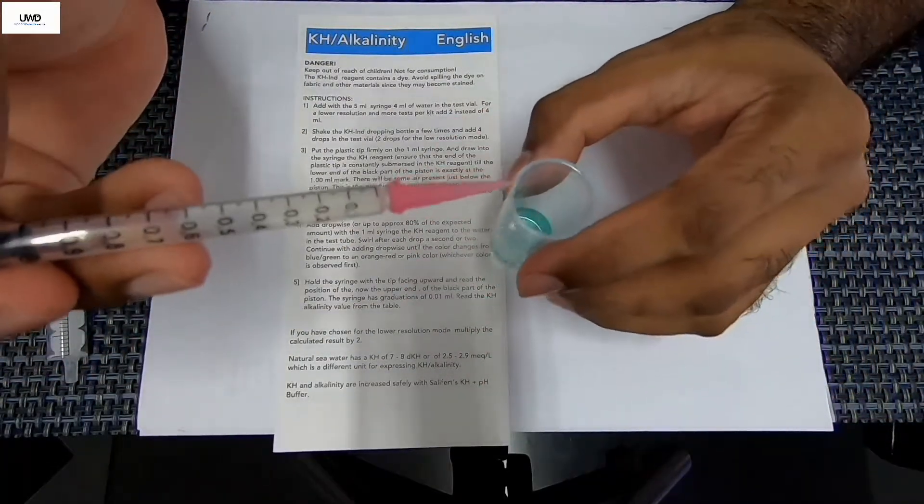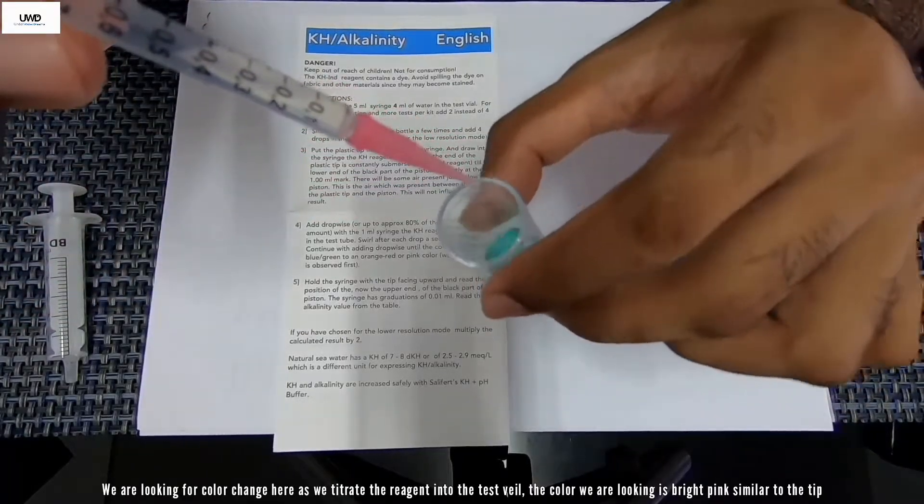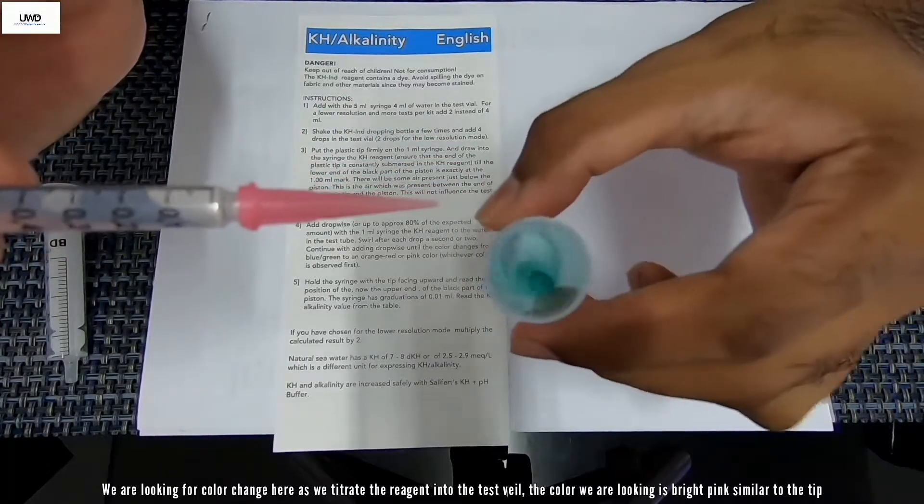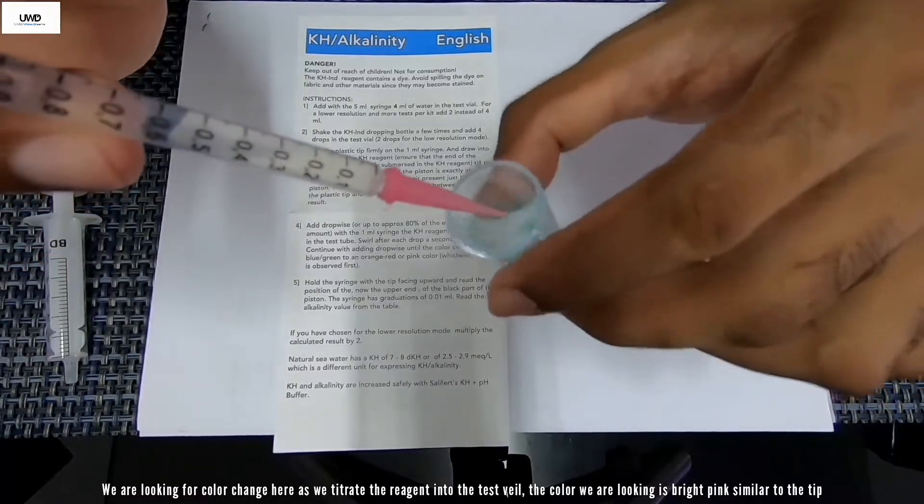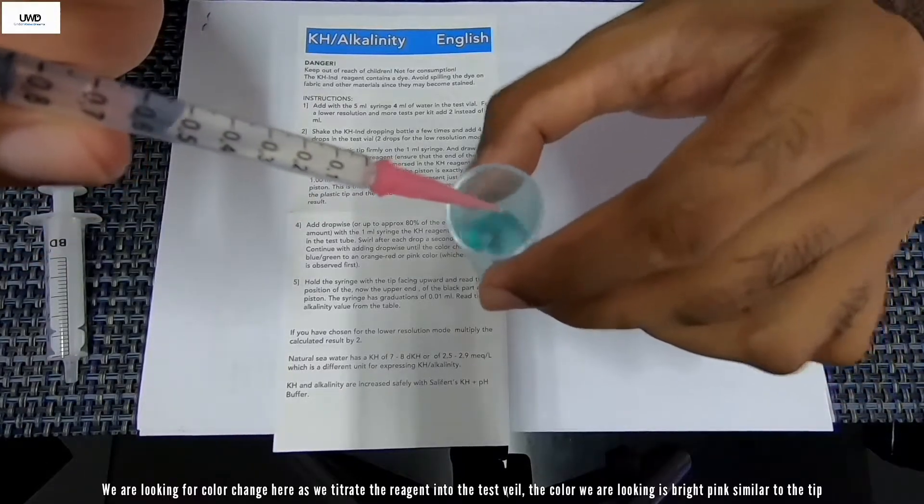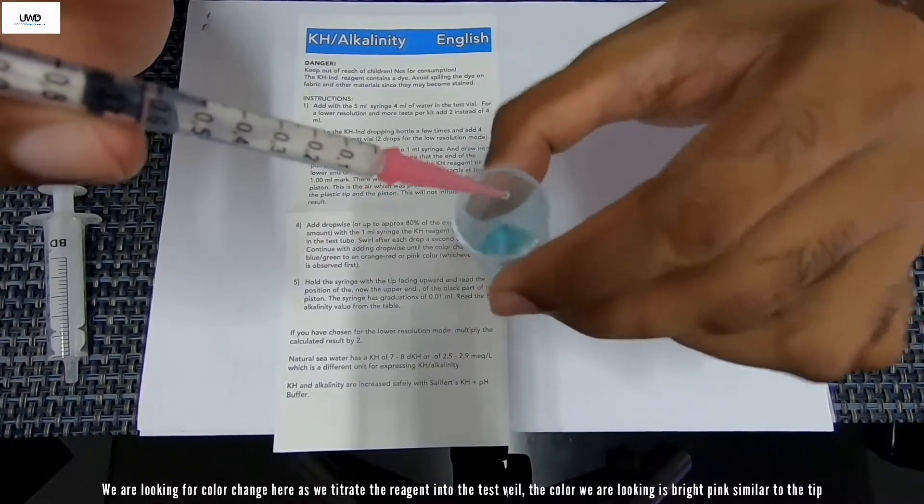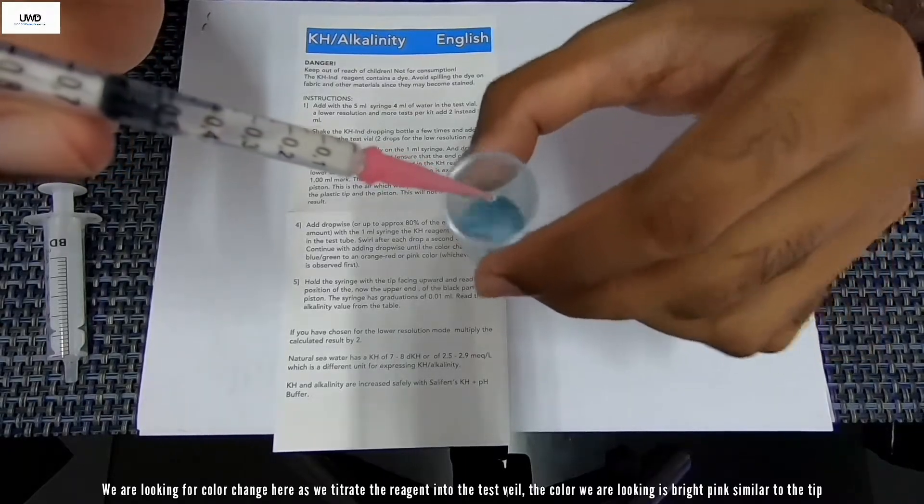We're going to be drawing all this liquid onto this test vial here until the color of this test vial turns to pink, bright pink. While doing this is what we call a titration method. While doing it, make sure you give it a little shake like this, always mixing it up. You can put little by little or a bit faster if you know your level earlier.